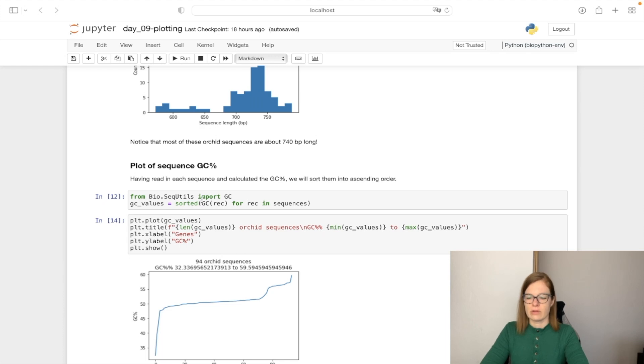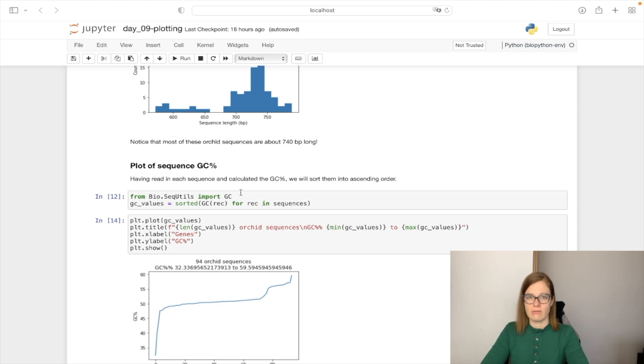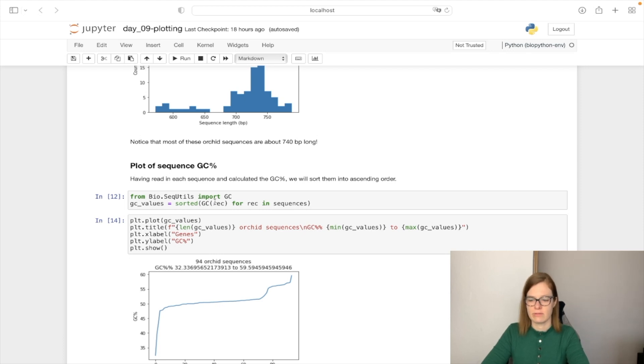So first what we need to do is import the GC functionality which will calculate our GC content. And similarly for the length of the sequences, we will loop through each of the sequence in sequences list and we will calculate the GC content of each of them.